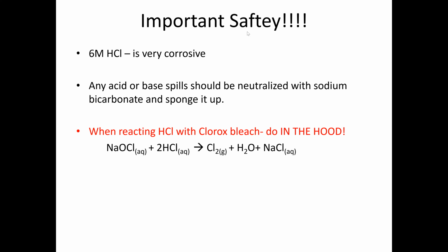So before we get to part 2 of experiment 2, just remember we're using 6 molar HCl. It's very corrosive. If you have large amounts of this spill, it's best to use sodium bicarbonate to neutralize it first and then clean it up.